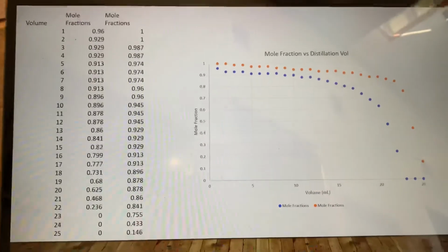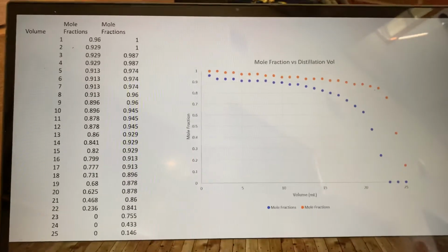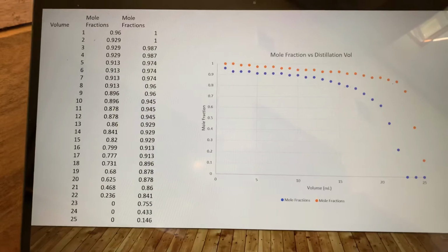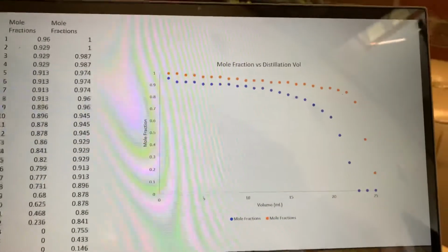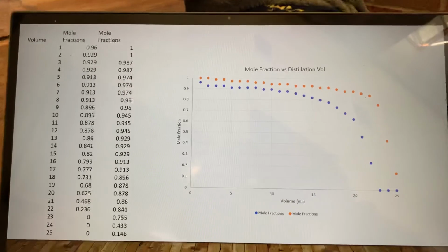So when it comes to increasing between 10 and 90%, it's not as normal. They're pretty steady together. It's not a big effect until you get down to this side of the graph. So you're not really able to use it because it's not very accurate. There's not a big difference, so it doesn't really matter.